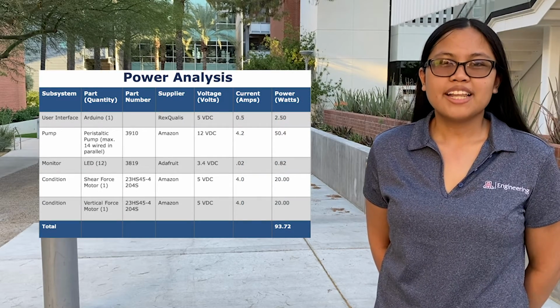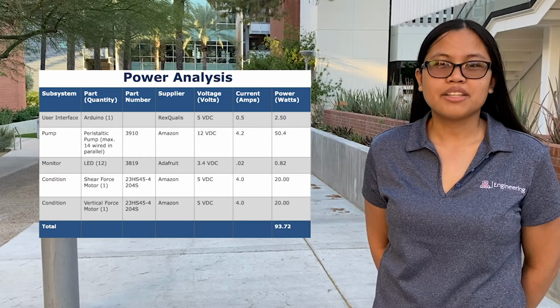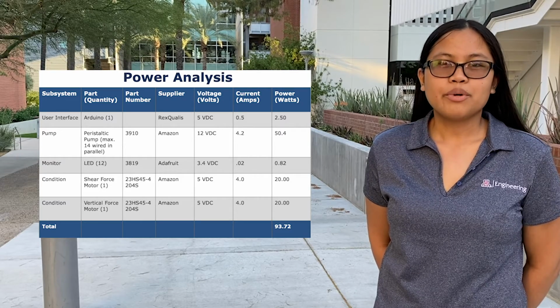We also analyzed the power required by our system to ensure that it could operate on the standard power available in the lab. We found our system to be well under this requirement. To mitigate the challenges of integrating our design with the existing system, our team prototyped as many of the components as possible. We created 3D printed versions of all custom components that required manufacturing and used these prototype components to perform testing to ensure all specifications and requirements were met.